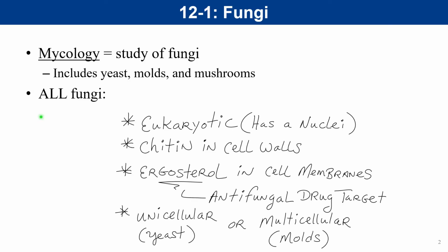This is a presentation on fungi outlining the activities covered in Microbiology Lab. The short list of organisms that we'll be covering today would be one of the first lessons in a mycology class. For General Microbiology Lab, we'll take a quick survey of some of the most important yeasts and molds, and we'll be skipping over mushrooms since they're a macroscopic type of organism.